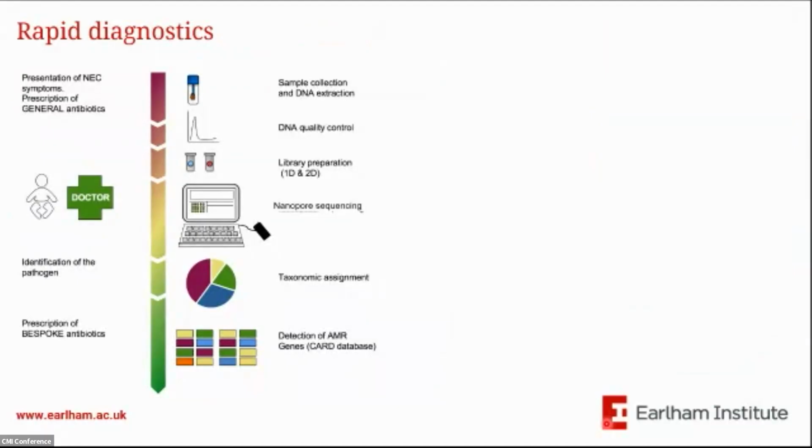We wanted to see how quickly we could go from sample through to complete analysis. So we set up the pipeline you can see here, where we go from fecal sample through DNA extraction, nanopore sequencing, and analysis. For analysis, we created a new software platform called NanookRT. The reason for this is that whilst the nanopore platform enables real-time analysis, it was poorly served at the time by real-time analysis tools. We couldn't do what we wanted with Metrichor, which was the Oxford Nanopore solution available at the time. So we created NanookRT.